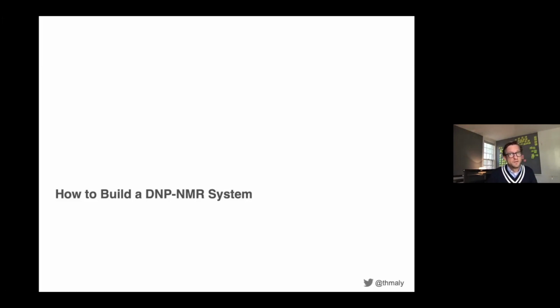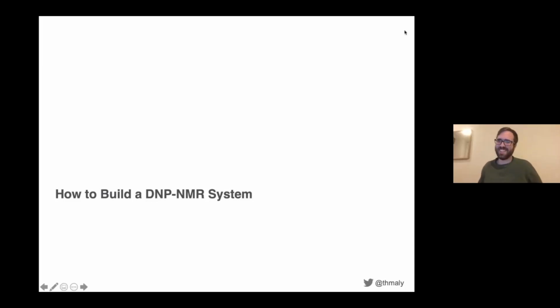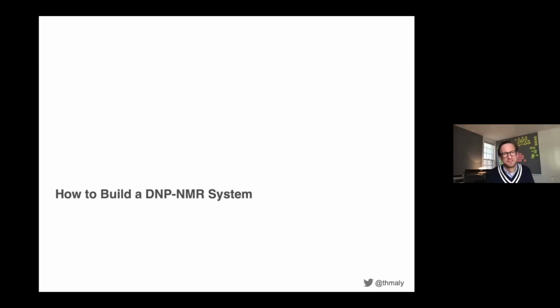And then if you look at where is really the frequency where the bulk of people are doing experiments, not everybody has access to a 1.2 gigahertz spectrometer. Everybody would like to, but unfortunately it's not yet. Agreed. All right, so let's go ahead and hit some of these other questions.